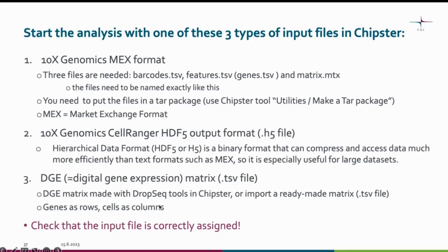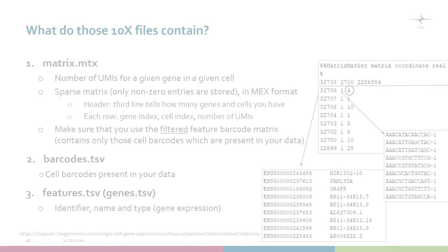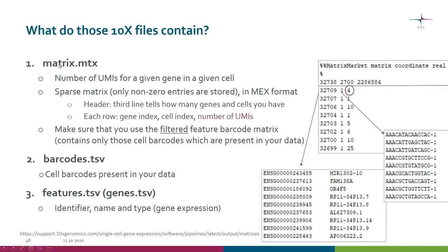Let's take a closer look at the 10x Genomics output files. Essentially you have three files and they need to be named correctly: the matrix file, barcodes, and features — which used to be called genes in older Cell Ranger versions. The main file is the matrix file, where you have the number of UMIs or transcripts for a given gene in a given cell.